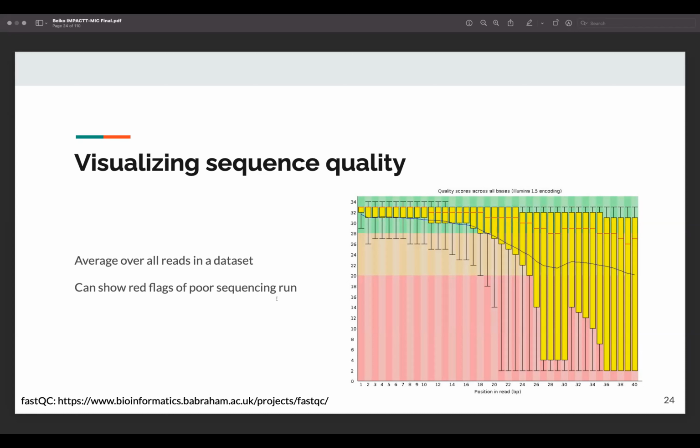Thank you, Morgan. You'll see in the tutorial we're working with today, we have primers that have an overlapping region, but sometimes you'll have primers that don't have one, and you can just concatenate your reads, and that can work too.